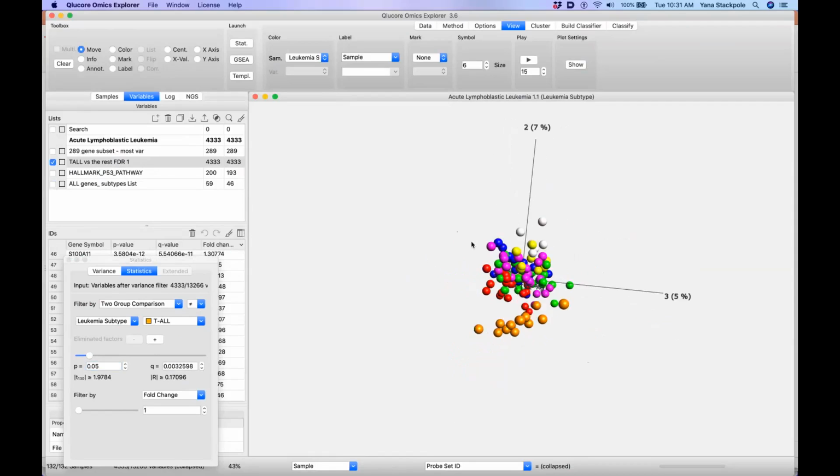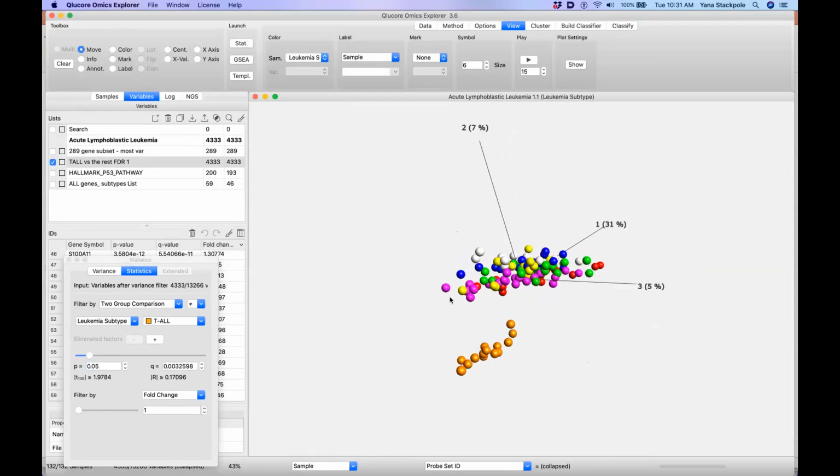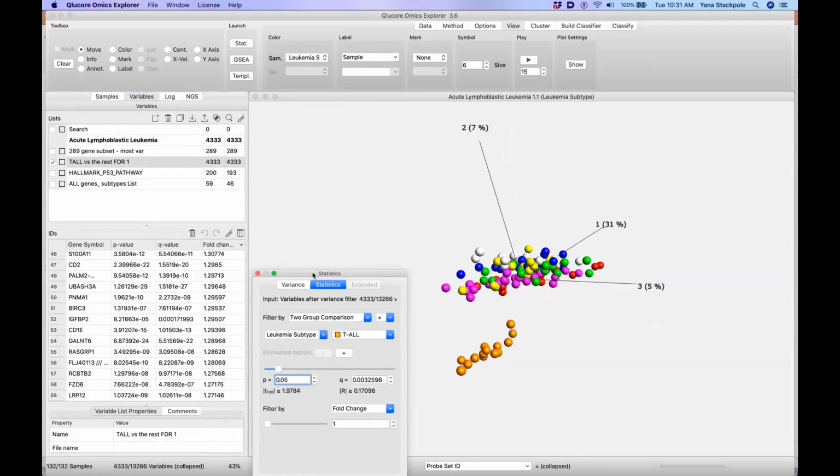And sometimes signatures will be directional. In my case, I used both up and down regulated genes to build the signature, and the same way with the published signature, just the genes which separate groups. But you may have a signature which looks for only upregulated genes, pointing to some genes up or down regulated in the specific condition.